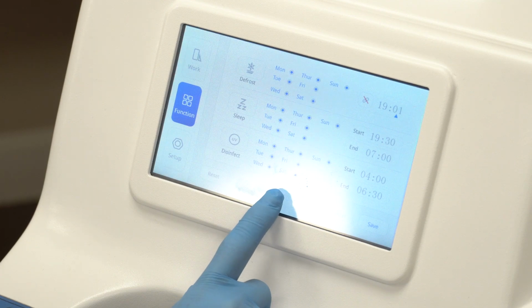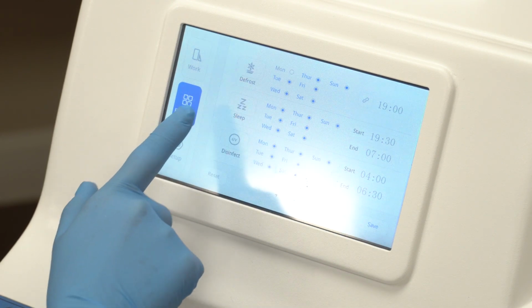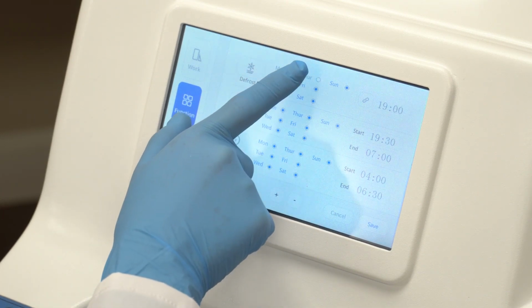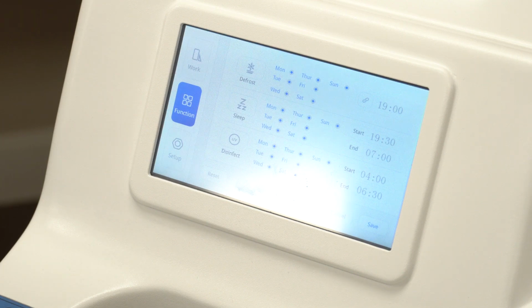Schedule automatic defrosting. You can schedule automatic defrosting on a daily cycle using the automatic defrost date setting. The cryostat will activate the defrosting function at the specified date and time. Here are some helpful tips to remember. Defrost duration. Typically, each defrost cycle lasts around 15 minutes. However, if the box temperature hits -5 degrees Celsius during defrosting, it may end prematurely.